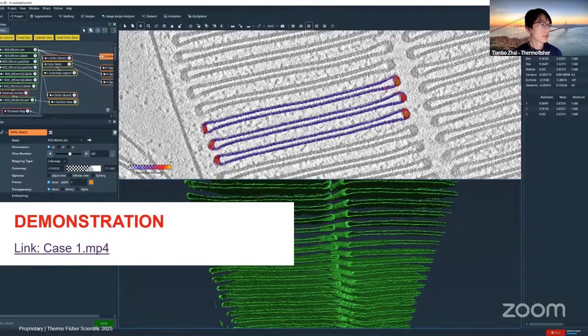So it's trying to extract the thickness value across those individually segmented structures and then assign a color. As you see from the scale bar, as the color is more towards the red, it is a higher value. And as it's towards purple or blue, they tend to represent a smaller value.